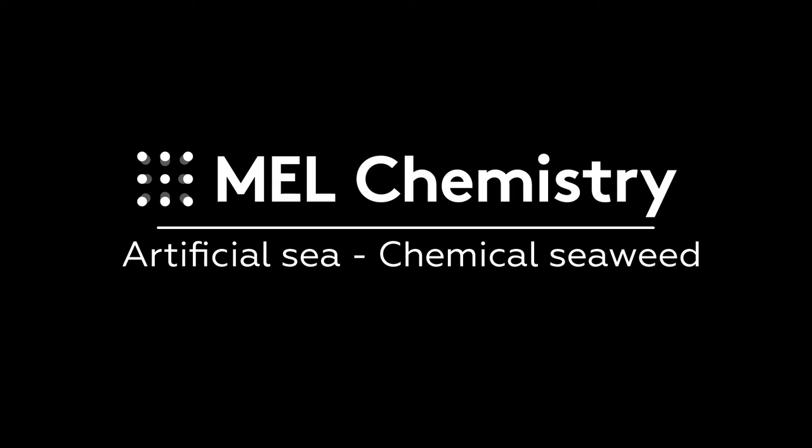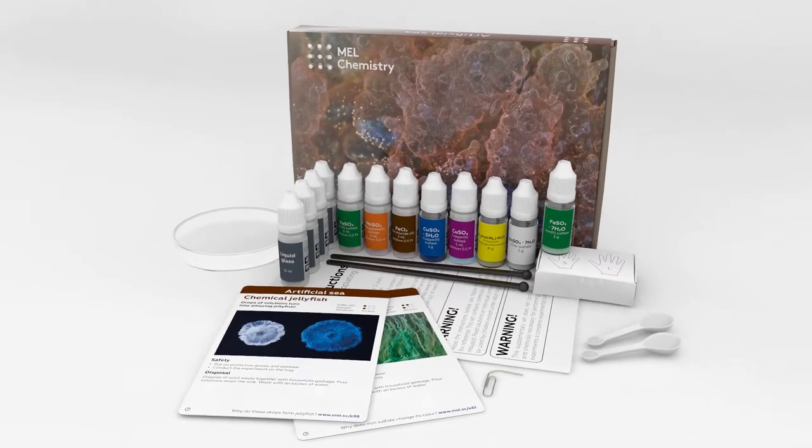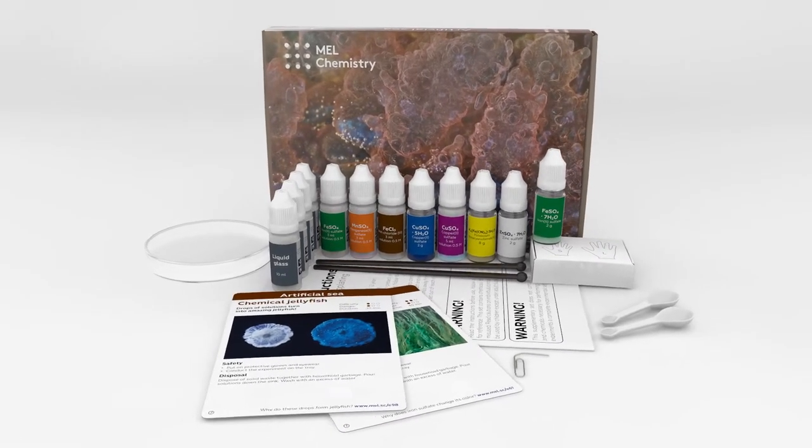Welcome to the wonderful world of chemistry. Today, with the help of the Artificial Sea Set by Mel Chemistry, we will grow chemical seaweed.